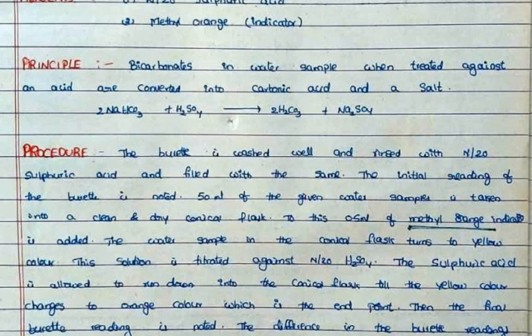Next, procedure. The burette is washed well and rinsed with N/20 sulfuric acid, and filled with the same. The initial reading of the burette is noted.